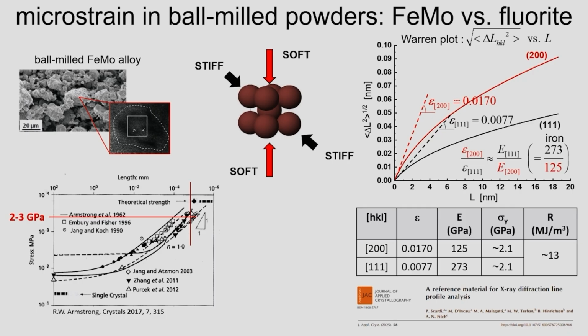Okay, so now let's see the application, the hands-on. Then, if we still have time and you're not totally destroyed, we can have a quick look at two things I left out. One is diffuse scattering and the other is faulting, at least to tell you a few things about faulting. Not in depth, just how it is.